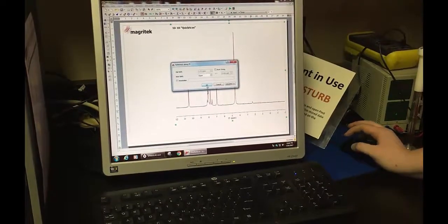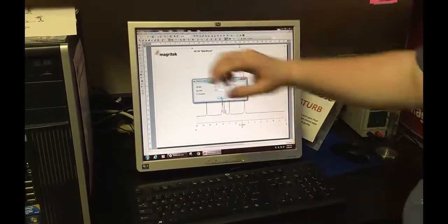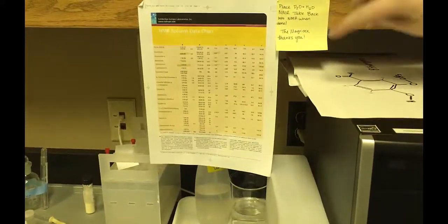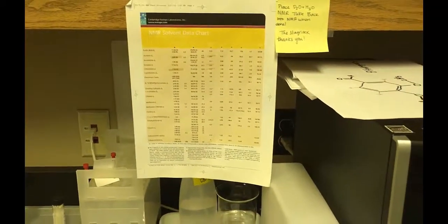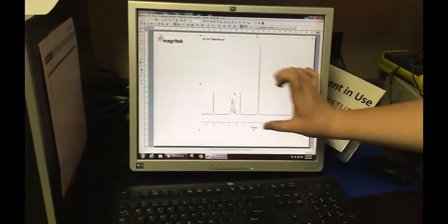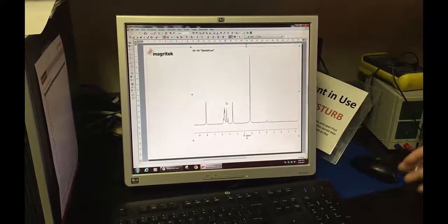If you use regular chloroform, that will come out at a different peak. And so we use our handy little sheets over here, and that'll tell you exactly which peaks your solvent is going to come out at. But today, since I'm using deuterated chloroform, it'll come out at 0. So I'll do that, and it'll shift the peaks over to where it's a more accurate representation of where those peaks come out at.